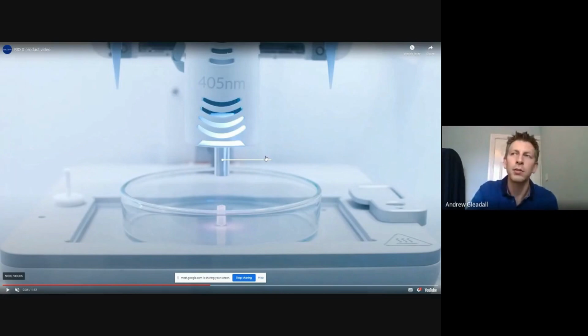So you'll typically try to have a material that is as runny as absolutely possible while still maintaining a reasonable structure once it's printed. You don't want it to just ooze into a sheet, like a puddle. So you have this balance of having it nice and runny for the cells to be happy, but stiff enough, viscous enough, for the structure to actually maintain its shape.